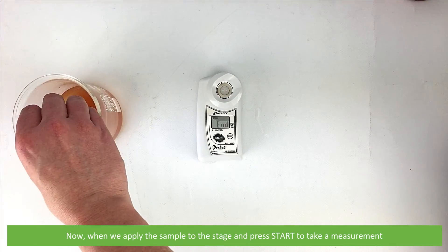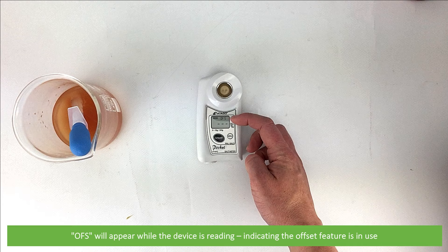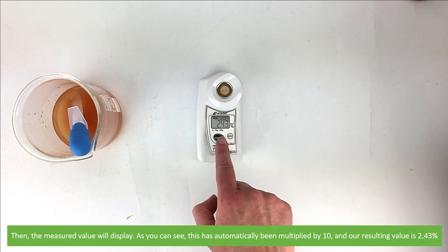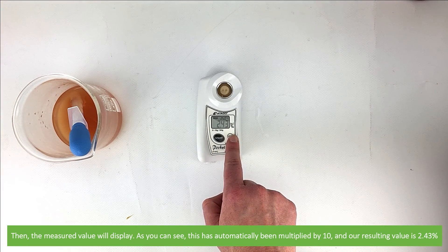Now, when we apply the sample to the stage and press start to take a measurement, 'OFS' will appear while the device is reading, indicating the offset feature is in use. Then the measured value will display. As you can see, this has automatically multiplied by 10 and our resulting value is 2.43, as seen on the screen.